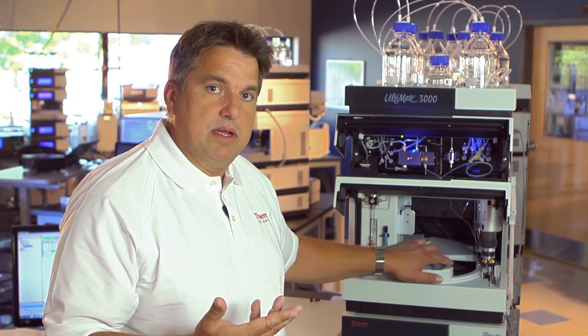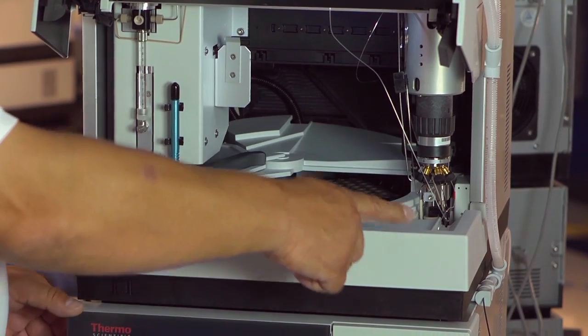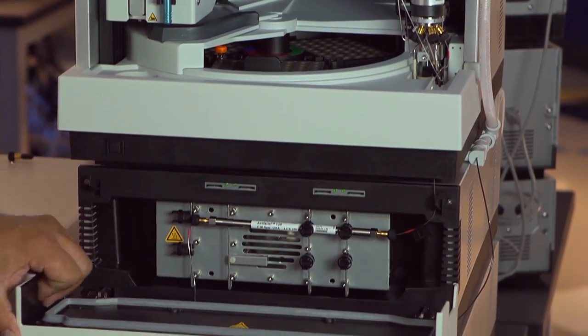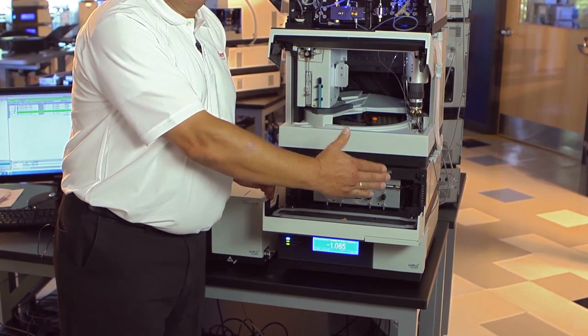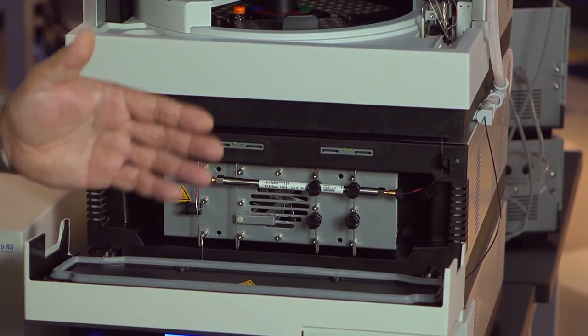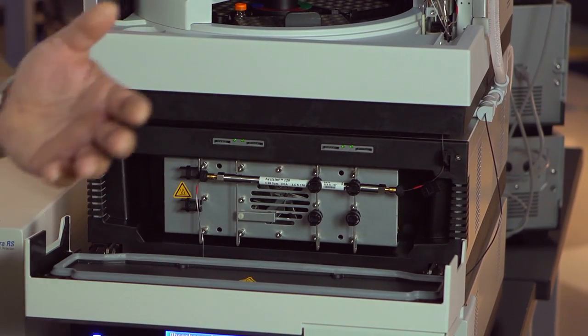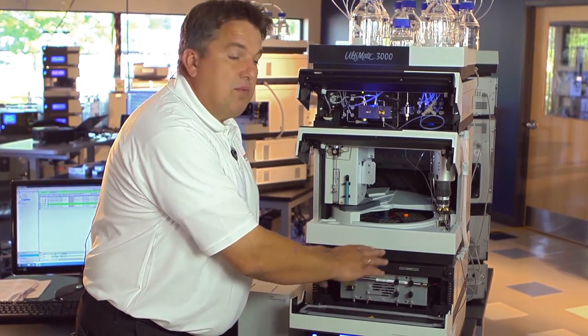Going from the pump to the autosampler, we have a very fast autosampler with the ability to realize very fast cycle times, with injection times less than 15 seconds, very often less than 10 seconds. Let me show you how short the connections are from the autosampler — from the point of injection to the column — and how spacious this column compartment is. It really allows you to put in very long traditional columns but also the new geometries of UHPLC columns, the short ones with 2.1 mm and lower diameters.